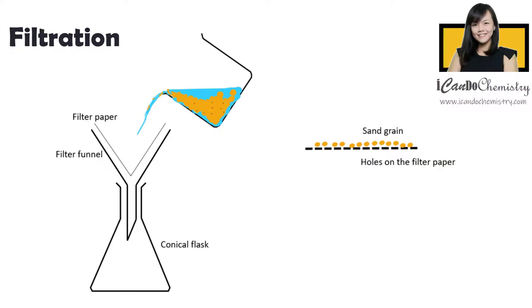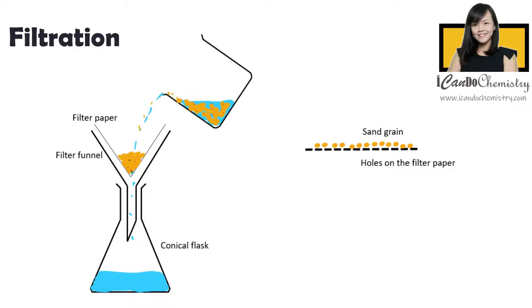We will pour the mixture through the filter paper. Now the filter paper acts as a sieve. There are small pores on the filter paper. Now the size is so small, only water can pass through. The solid particles that are bigger than the pores of the filter paper will not be able to do so. Pour the mixture into the filter paper. You will realize sand will remain in the filter paper. Water will flow through into the conical flask.